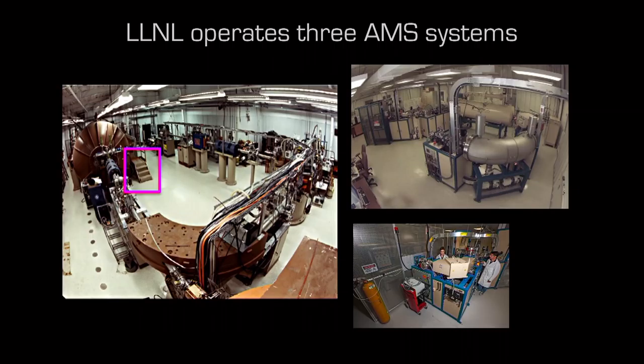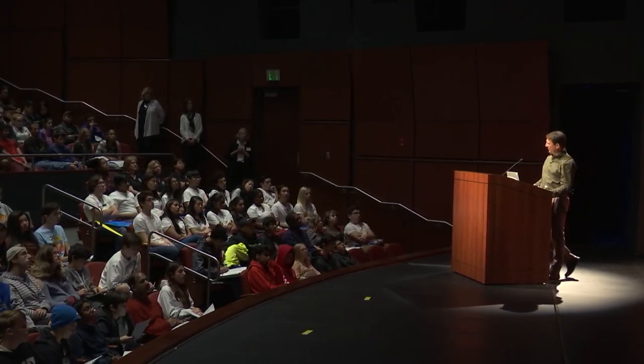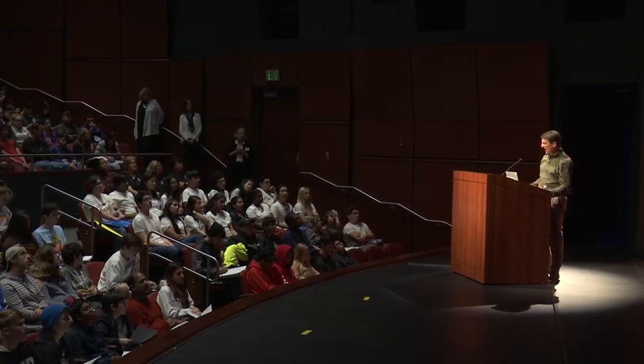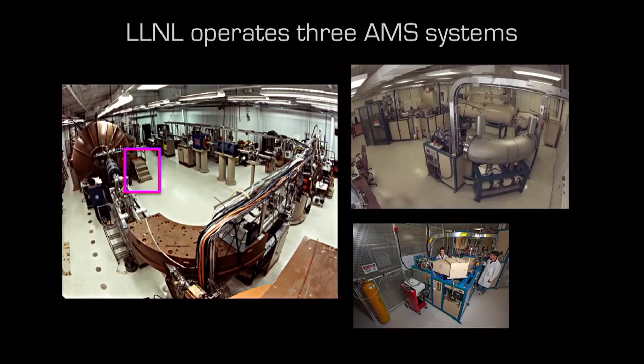And then the small machine on the bottom, that's the one that we use for all our biomedical applications. It's strictly dedicated for biology, and it only detects C14. So it doesn't have to be as powerful as these other machines, but it fits in a smaller lab, which is nice. And that's the one that's hooked up to this moving wire interface that I just showed you earlier.